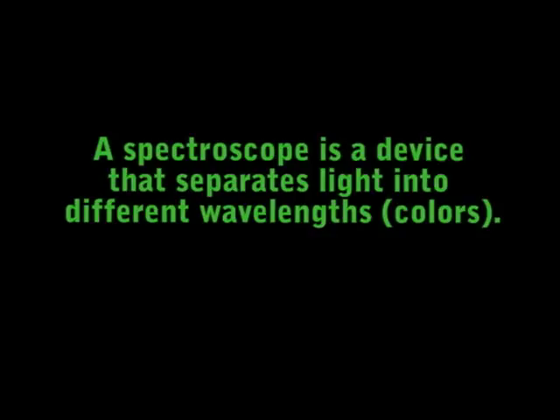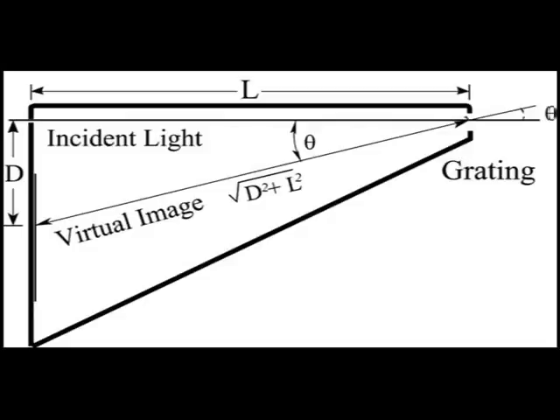The only material you will need for this lab is a spectroscope. The spectroscope passes the light through very small slits to separate it into distinct wavelengths or colors. The different wavelengths that make up an emission can be measured by the ruler inside of the spectroscope. You will record the number below each band of light with as much precision as possible. The number corresponds to the wavelength of light that you are seeing.